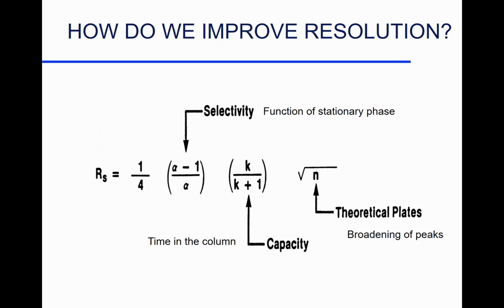But let's go back to the idea of improving separation. When we run a sample on any tool, any technique, and we want to separate them, it really takes some time, and maybe we can go ahead and separate two things and we can measure them accurately.